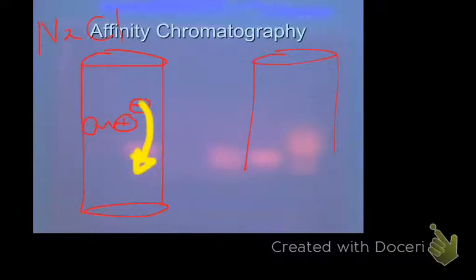Yeah. Is there a possibility that that can denature the protein because of the different charges going on? Usually, you're doing this under conducive ionic strengths. I mean, there's always that possibility, but usually you're doing it at ionic strengths that are conducive for your protein.